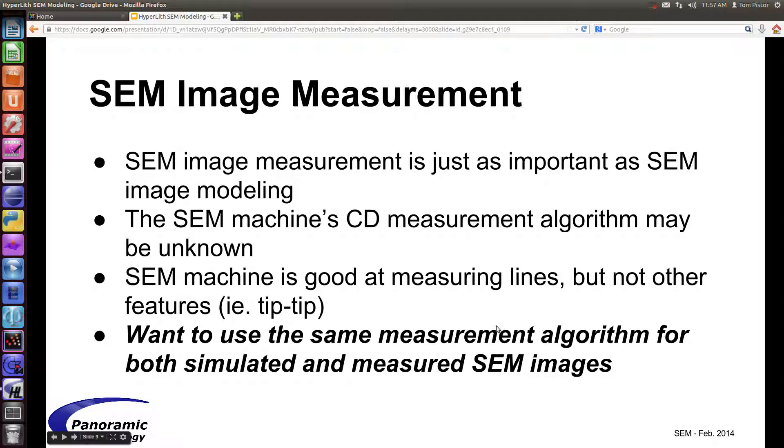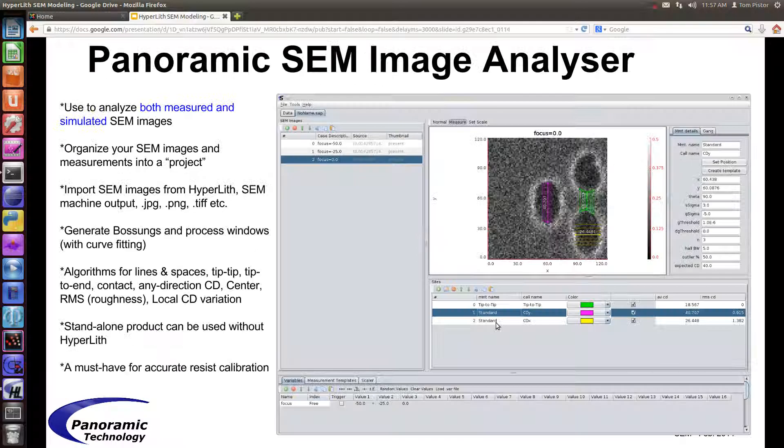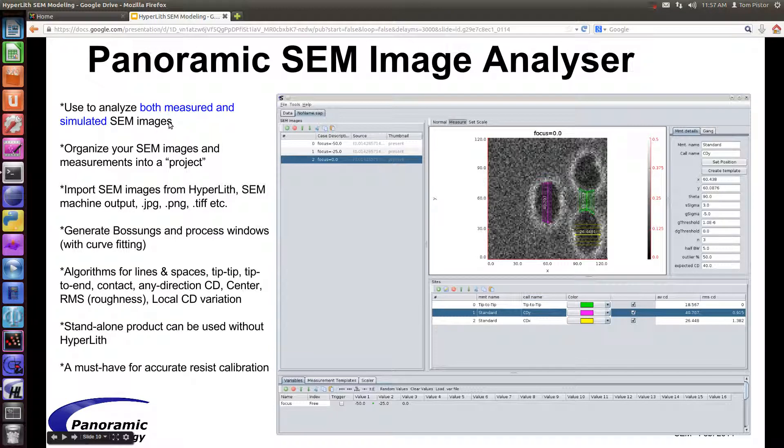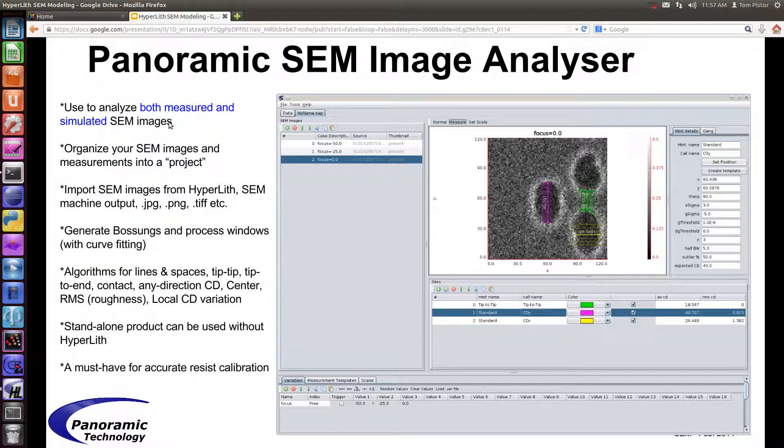But the main thing is that we want to be able to use the same measurement algorithm for both simulated and measured SEM images. When you're calibrating a resist, that's when you'd want to do that.